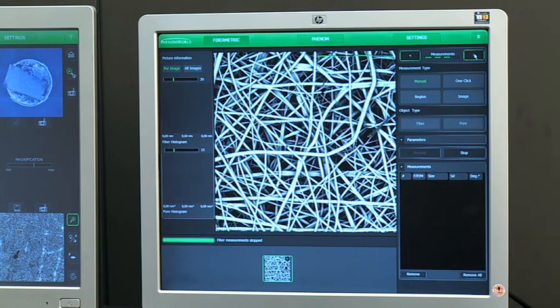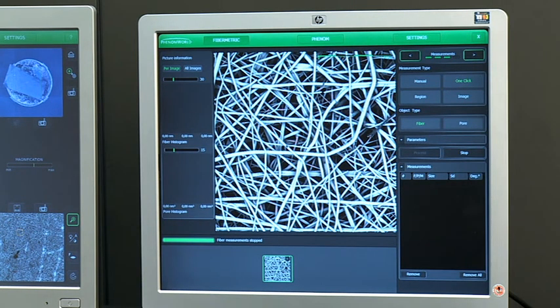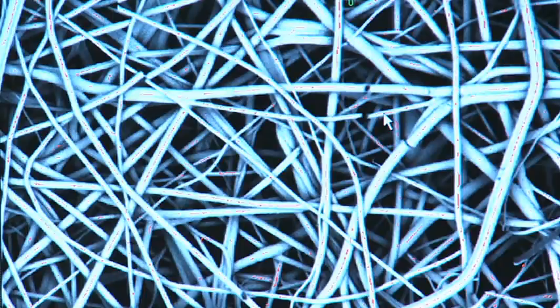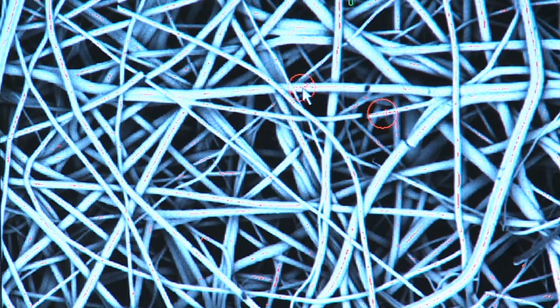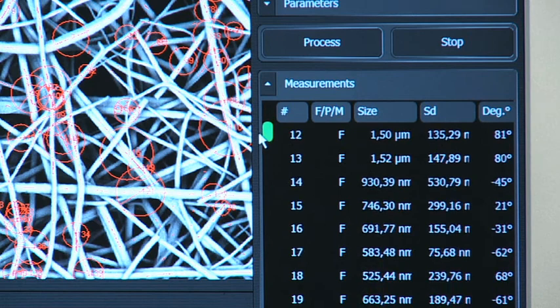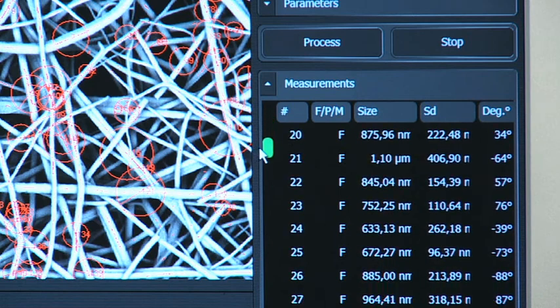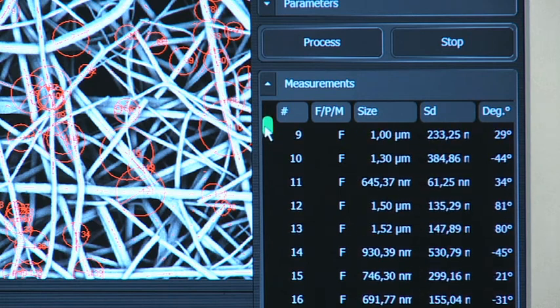Measurements can be done in manual or automated mode. The automated one-click method allows selection of individual fibers that will then be identified and measured. The measurements are displayed in the results table.